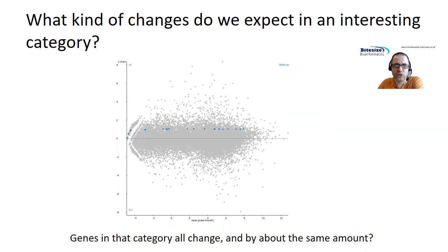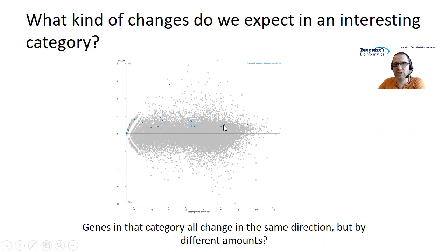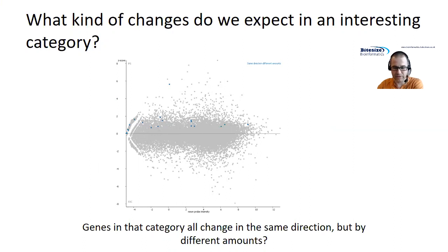In many cases that's probably too strict. It might be enough to say: I want my genes to generally be changing and I'd like it if they changed all in the same direction, but it's unrealistic to think they're all going to go up by the same amount. So I could set a requirement that these genes go up. In the example, you can see the highlighted genes are all going up, but some are going up a lot and some only by small amounts. In real functionally connected sets, it's much more likely that there'll be variability in the level to which genes are upregulated or downregulated.